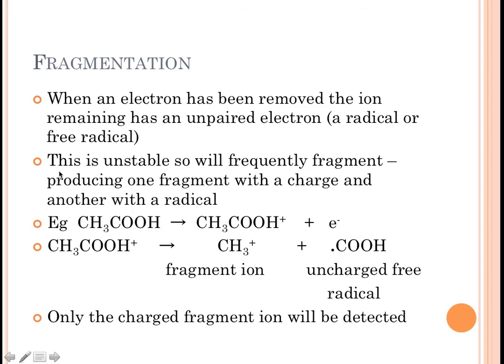Okay? One more thing. In the ionization chamber, we have our molecule, in this case let's call it ethanoic acid, and that is going to get ionized to make this cation. And I know it's something that doesn't normally make a cation, that's okay. Just in this specific instance it is. And of course an electron, because we need a balanced equation.